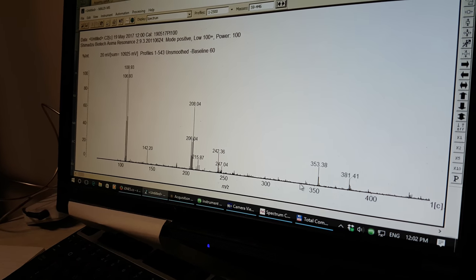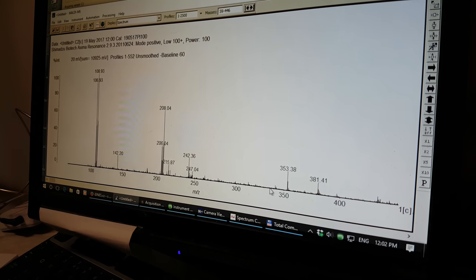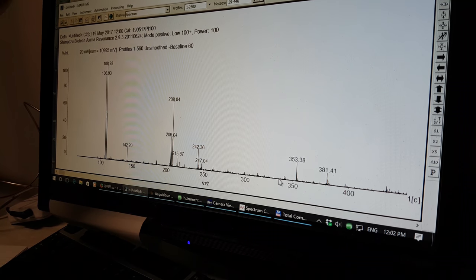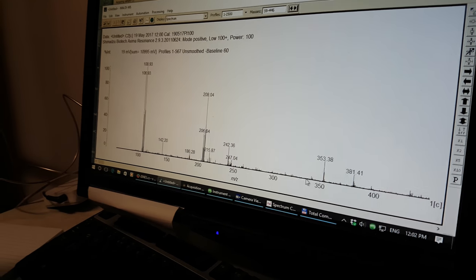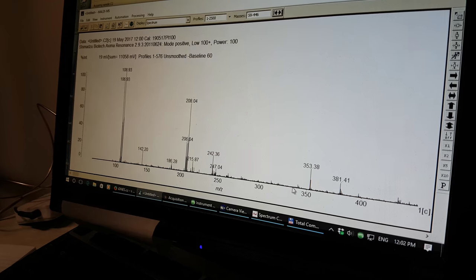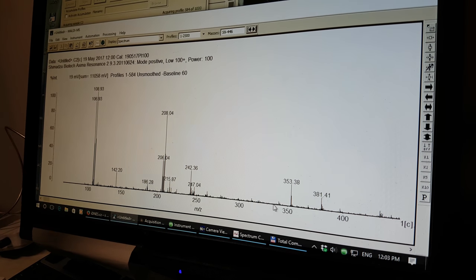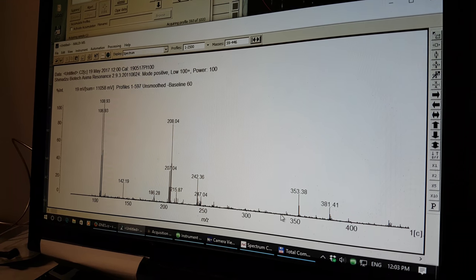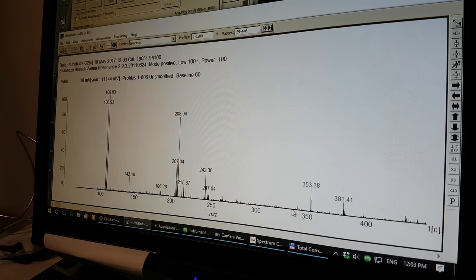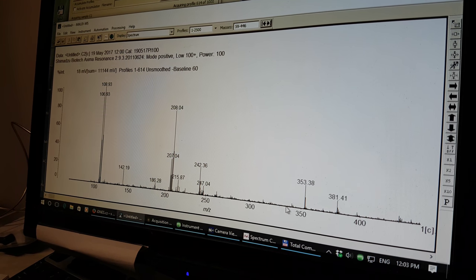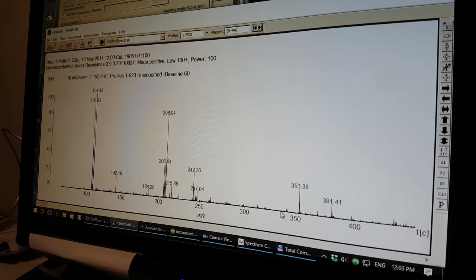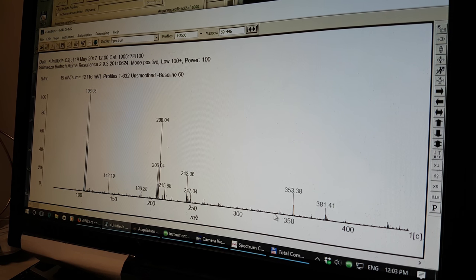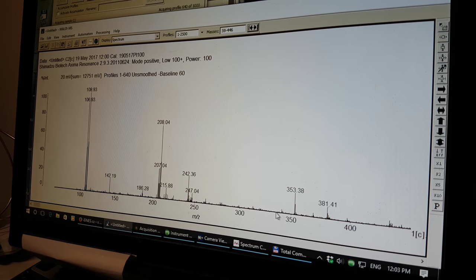What energy level have you got here now? It's 100 units. And then you've got something there that looks mono isotopic at 142.19 on the second sample time.